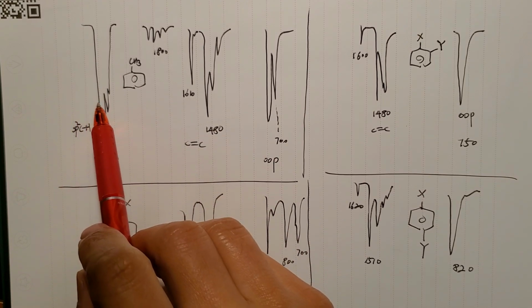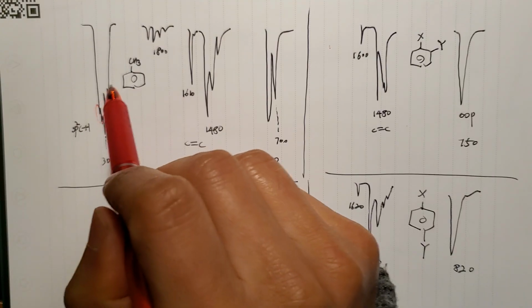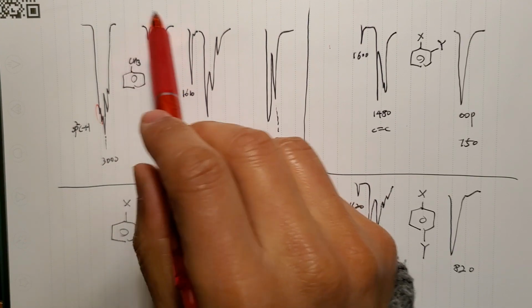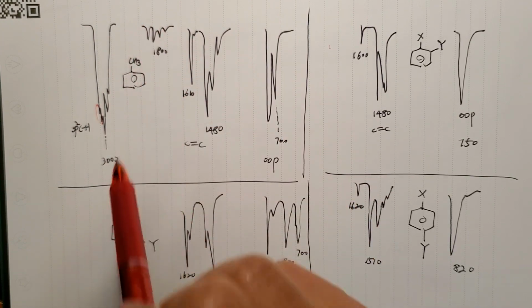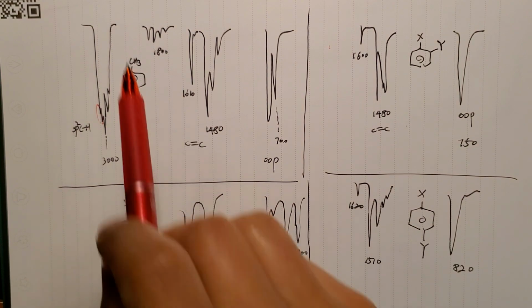So it's going to happen always here, here, here as well. I didn't put them there because of the space. And also another thing you can have is around 1800, you can have overtone here as well. I mean, every case. And their shapes come in different shapes, but I'm not going to talk about that.